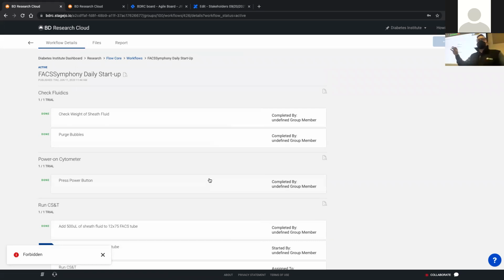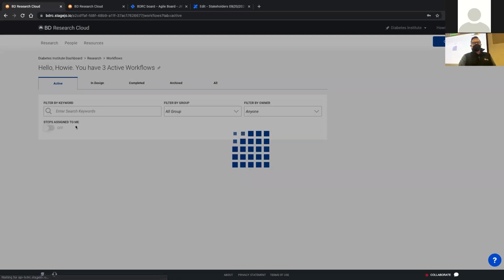So currently these features aren't directly communicating with the cytometer, but that's what I'm working on right now with the team that's making the cytometer agent. So those will go live, but these workflow features already exist, and we're working on integrating them.